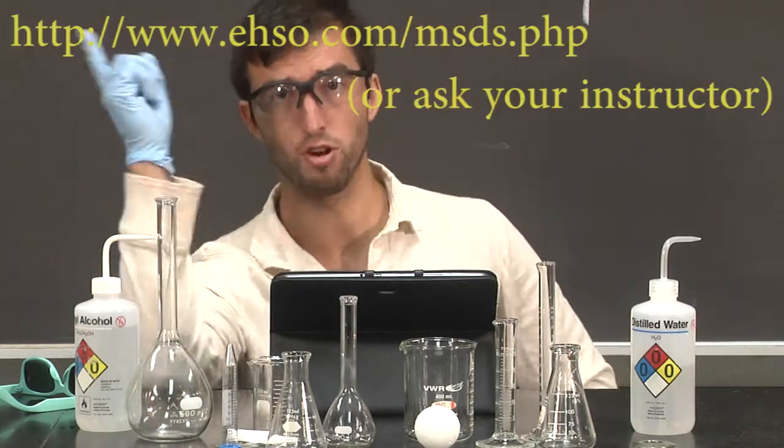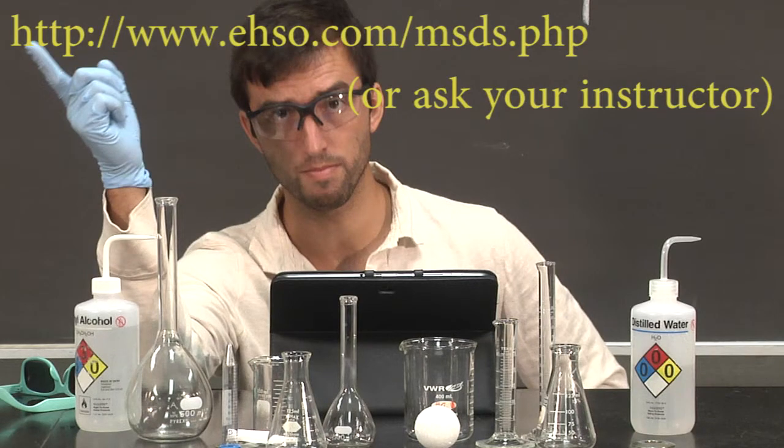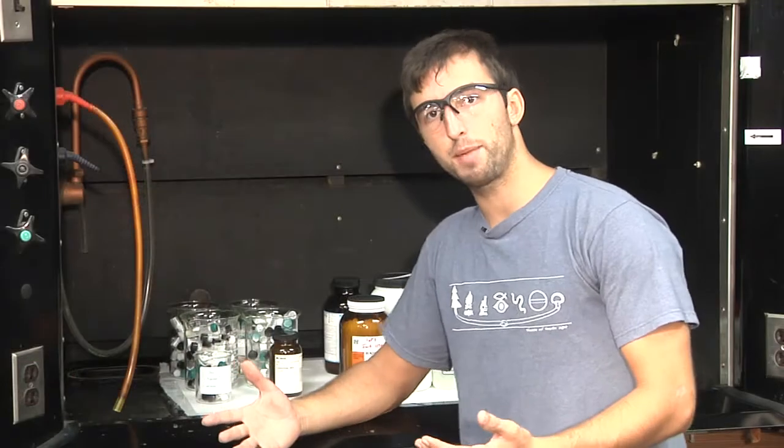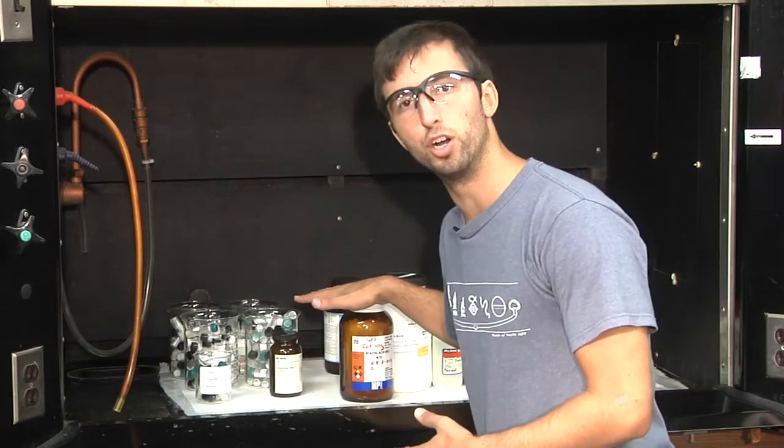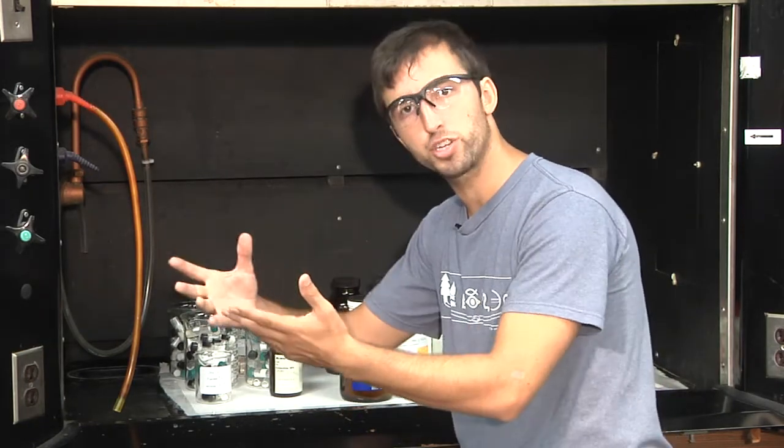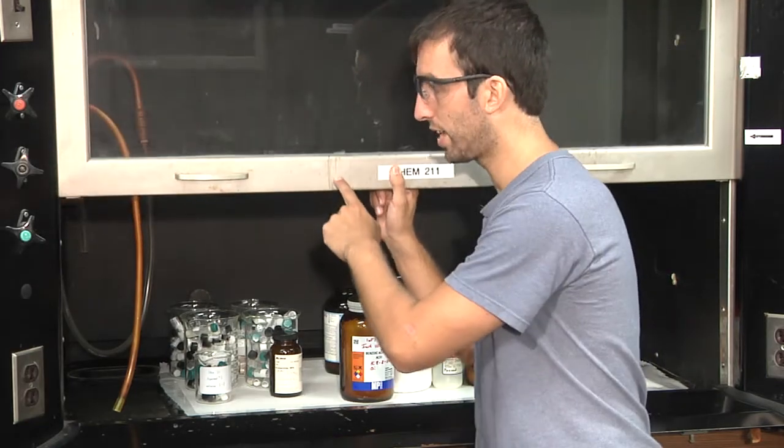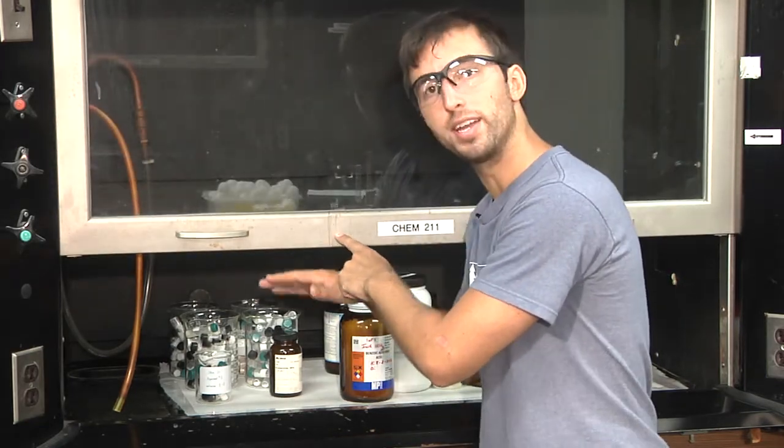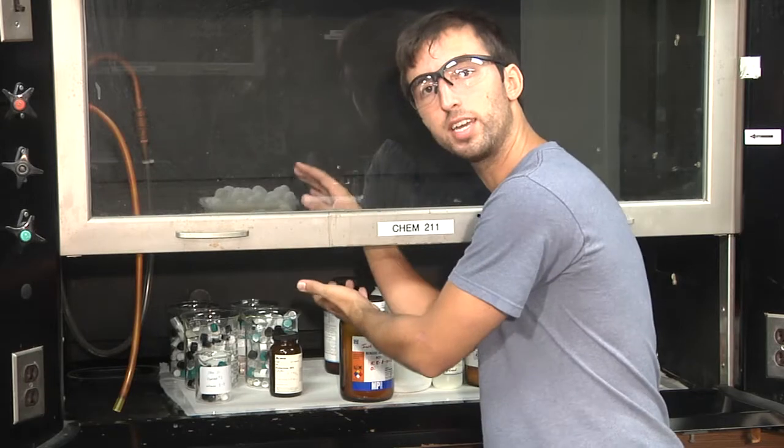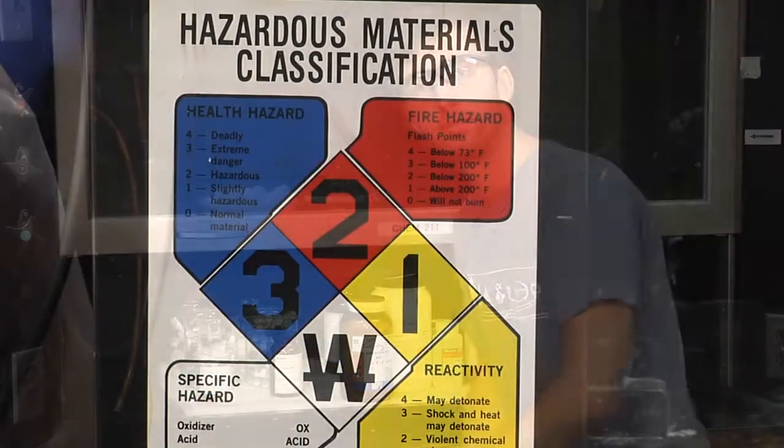They can be found over here. If you are using chemicals in the hood, please leave them in the hood and fill only a small portion to take back to your desk. Also make sure that this is kept at a low height so that air is sucked in and nothing comes out.